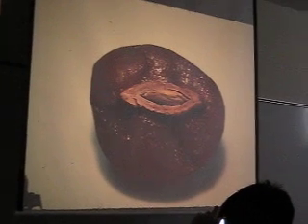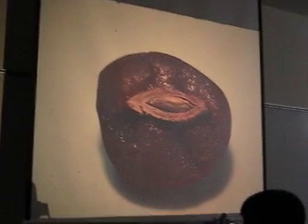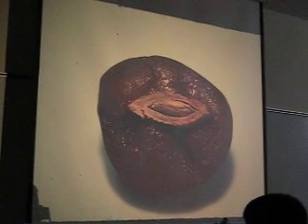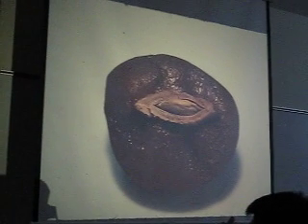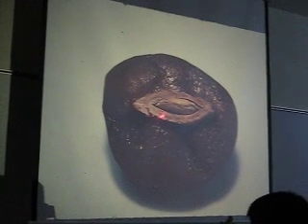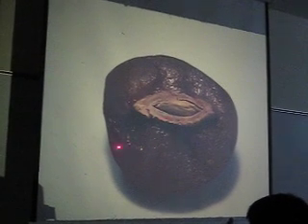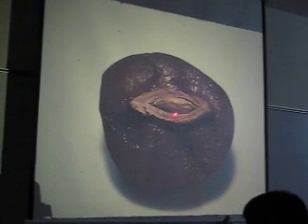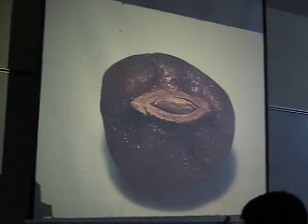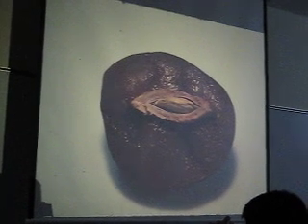And years ago when we taught general botany, you always bashed open a plum from Jewel with a hammer. You don't want to bash it with this, you know, the soft stuff you get in your face. So I bashed open the pit or stone, and this is what? Well, exocarp, mesocarp, endocarp, and what's inside? One seed. Okay, so that's a plum from Jules. All right.